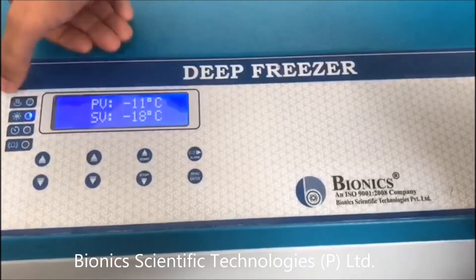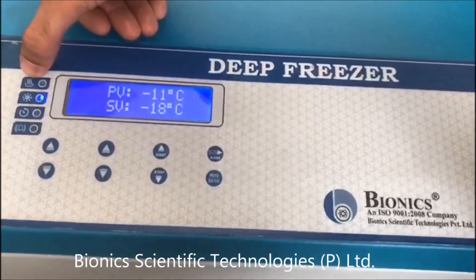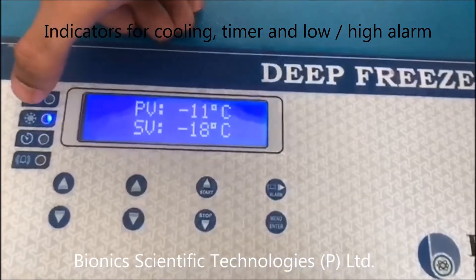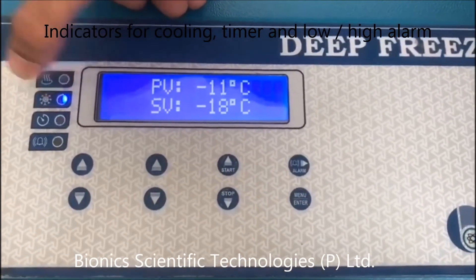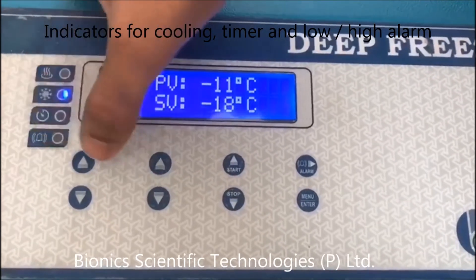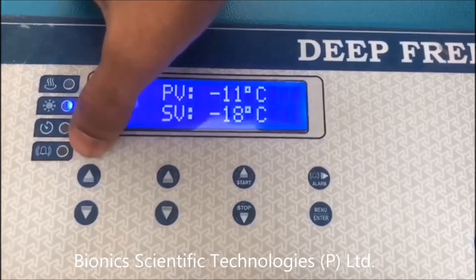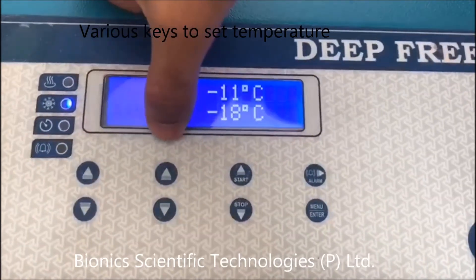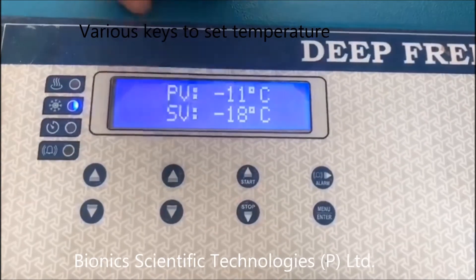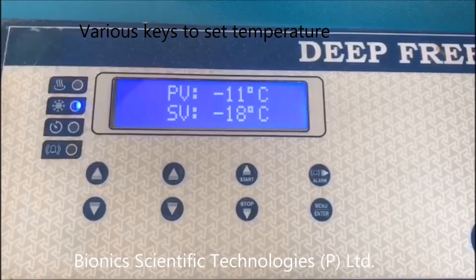These are the various functions available on the control panel. This is the heat indicator, this is the cool indicator, this is the alarm indicator, and this is for the timer. These are the up and down keys through which you can adjust the temperature or adjust your alarm settings.